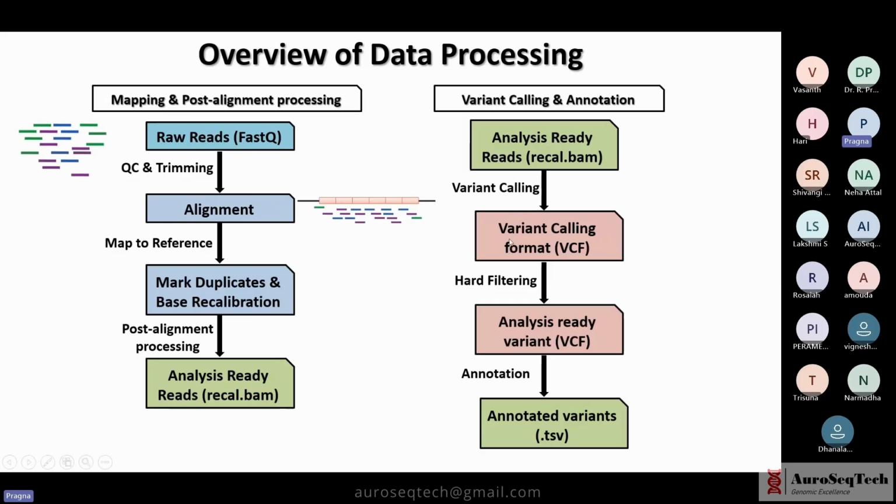What is variant calling? A tool, for example GATK HaplotypeCaller, checks locally wherever there is a variant, or a difference from the reference genome, does a local realignment, and calls the variant. This way we get a VCF format file with a number of variants. This is further filtered by different methods and then annotated.